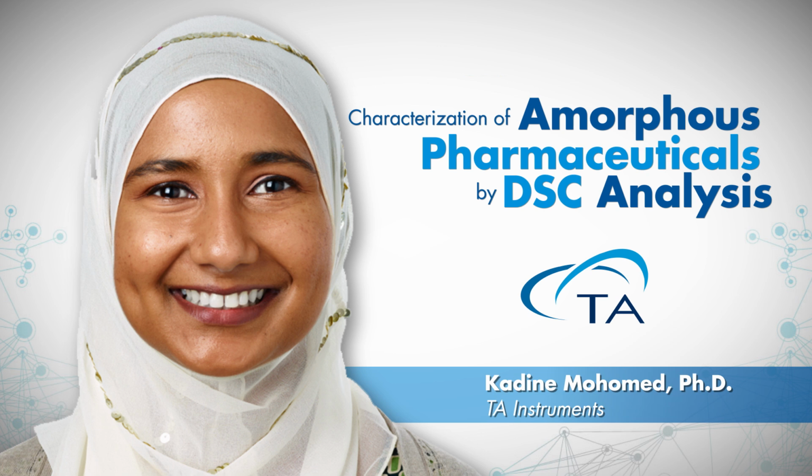When a material is plasticized, the glass transition will be a sum total of the Tg and volume fraction of the active ingredient, as well as the Tg and volume fraction of the additive. And if that plasticizer is miscible with the pharmaceutical material, it's going to shift that Tg. So you'll have a Tg that will lie somewhere between the Tg of the pharmaceutical sample and the Tg of the additive or plasticizer itself.